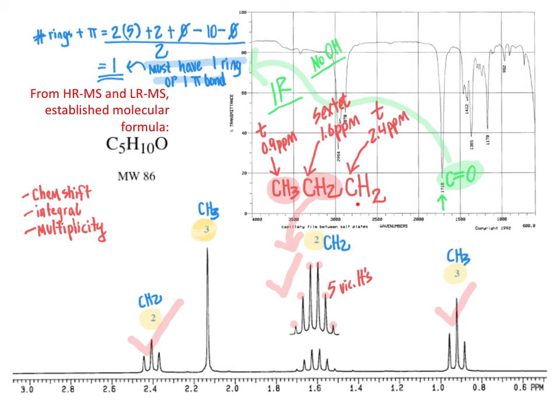And so that means that adjacent over here in this position that we haven't filled in yet, there can be no vicinal hydrogens there. So what could there be instead there? Because we aren't at the end of the molecule yet, and we need to plug in additional atoms. So we have to think about what we have available in our puzzle set that we could plug in here. What we have available left in our puzzle set is a CH3 group that we saw in the NMR spectrum that we haven't accounted for yet, the one that's at about 2.1 ppm that I'm circling here. That will not fit in here because that would terminate the molecule if we plugged a CH3 group in right here.